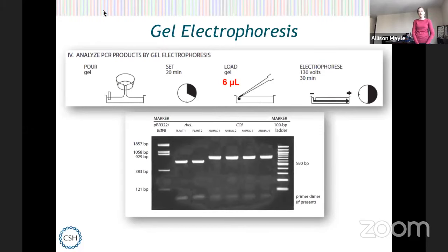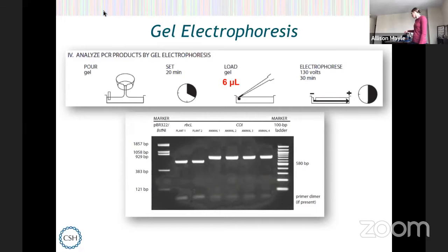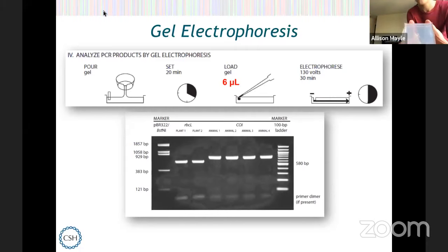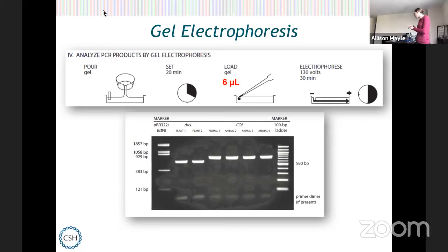I have from our DNA Barcoding 101 site some of the steps written up there. I've already done the first part, which was to heat up our agarose gel — agarose is a sugar that comes from seaweed. I heated that up, poured it into a little mold, and made a gel. After about 20 minutes it's set. We also put a comb inside the gel that makes these little pockets at the top called wells — that's where we're actually going to put our DNA so that we can run gel electrophoresis and see the results.